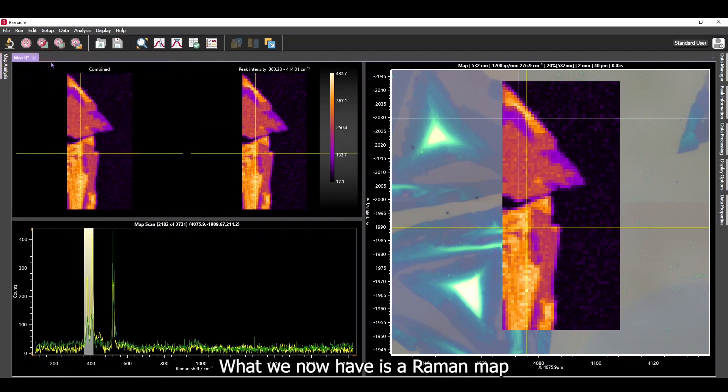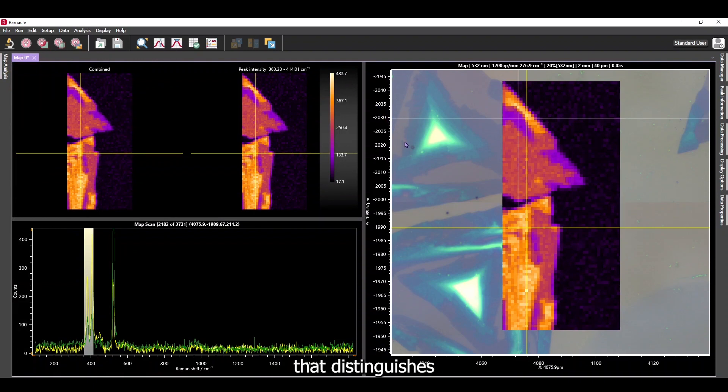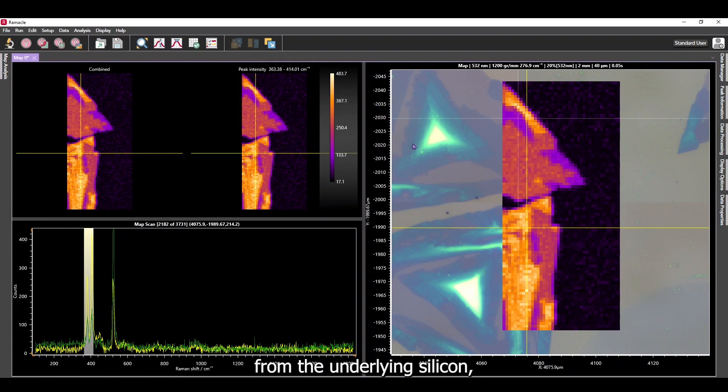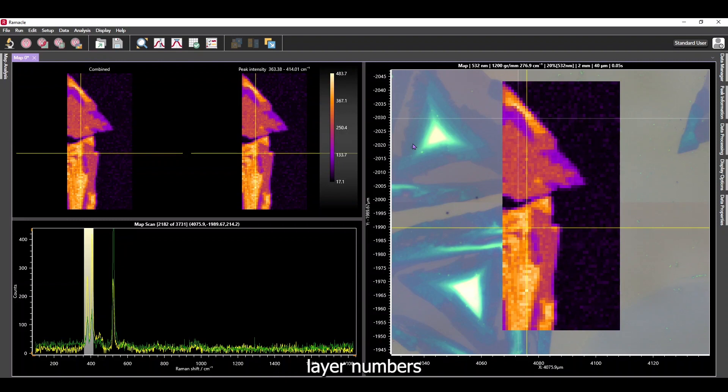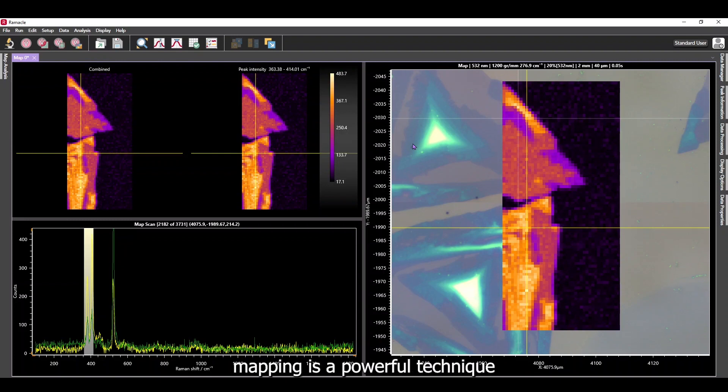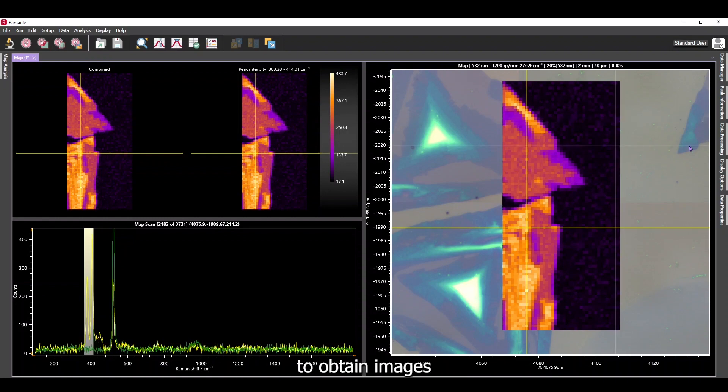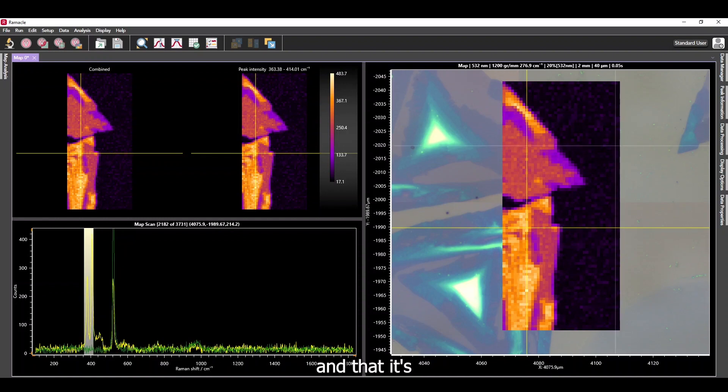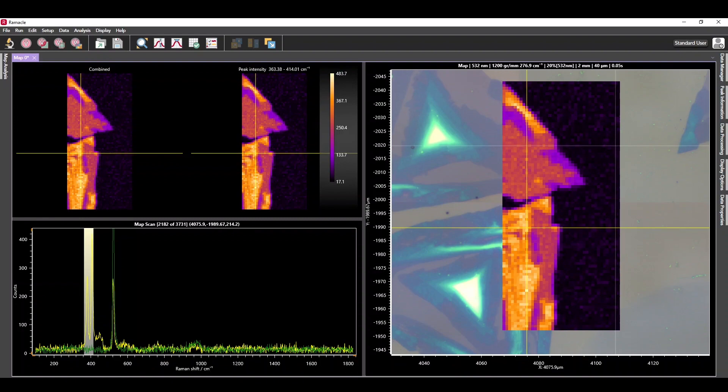We now have a Raman map that distinguishes the molybdenum disulfide crystals from the underlying silicon and areas of differing layer numbers on both of the crystals. We have shown that Raman mapping is a powerful technique that allows you to obtain images of highly specific chemical information and that it's really easy to perform.